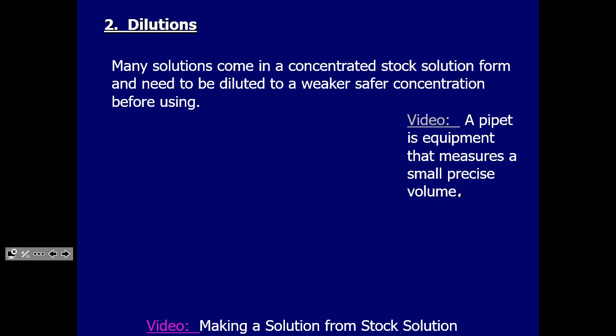Then that will be 10 plus or minus 0.04. So I know exactly that it's 10.0. That's 3 significant digits. I know that to 3 significant digits. Okay? And that's important that we know it to 3 significant digits. These pieces of equipment here are very expensive. Well, you know, something like this is probably $45, $50. Something like this is probably $30 to $40, even though it's just one little thing. And that's because precise things are expensive things, because it takes time and effort to make it properly.